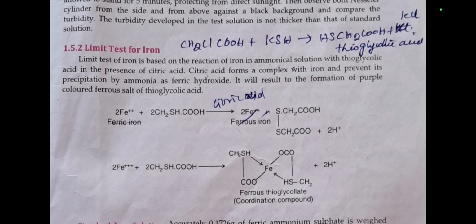So what is the principle involved in the limit test for iron? It is based on the reaction of iron in ammoniacal solution with thioglycolic acid in the presence of citric acid. Here the citric acid forms a complex with iron and prevents its precipitation by ammonia as ferric hydroxide. So what is the main function of citric acid here? It prevents precipitation by ammonia as ferric hydroxide.